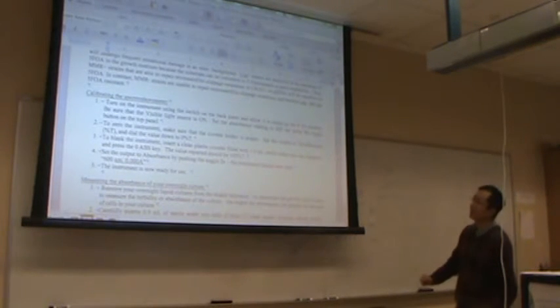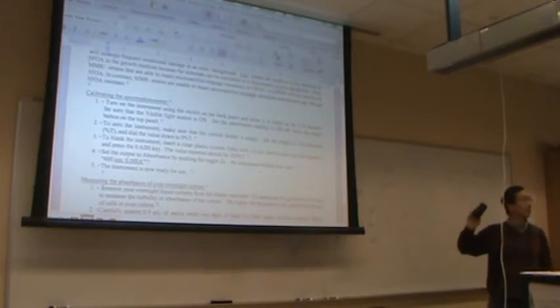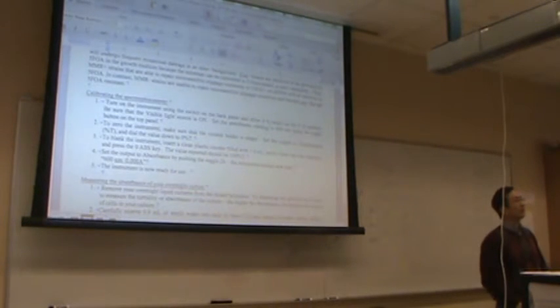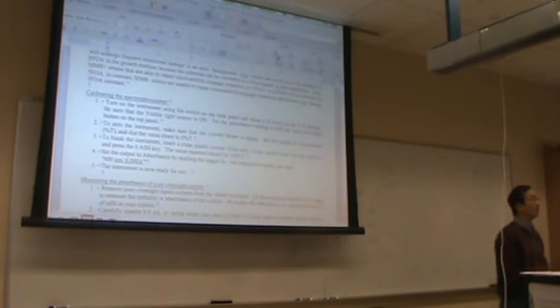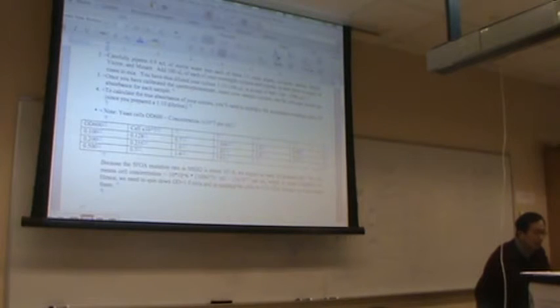Since there are few of them in this section, I can just go downstairs, spin them in the swinging bucket, and then bring them back up. So according to the protocol, we have measured the absorbance of all the cultures. The whole first one is over there.